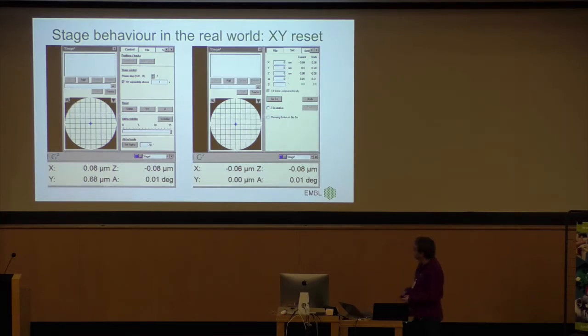So what you do then in software is you say, I want to go to these 4 positions. You want to reset this Y value when the tilt is done. So here I have 500. But you just set it back to 0. So you do that, you minimize your shifts tremendously. This has been in the tomography software at FEI for years. And in my script, I also built it in a few years ago. And then recently, David also put it into the SerialEM stuff. So it's very important to bring your total shifts back.